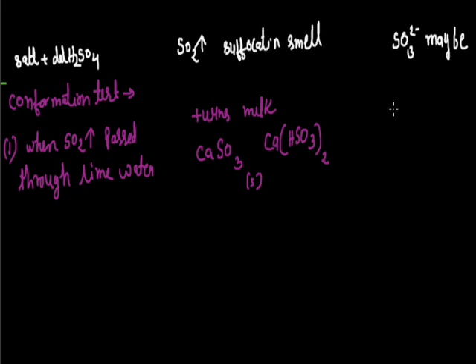So we can see that sulfite is confirmed, but the problem is that a similar type of test is given by CO2, which we have already discussed.